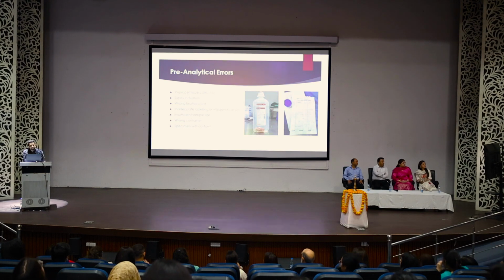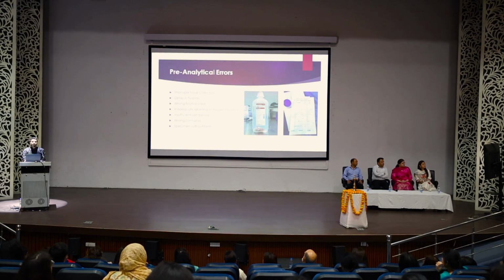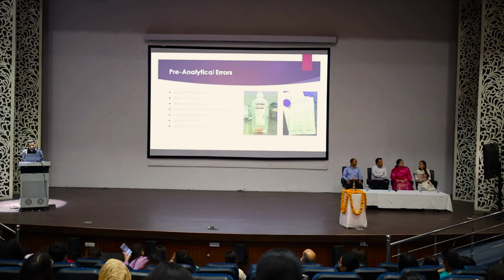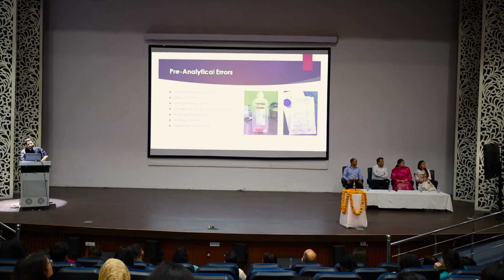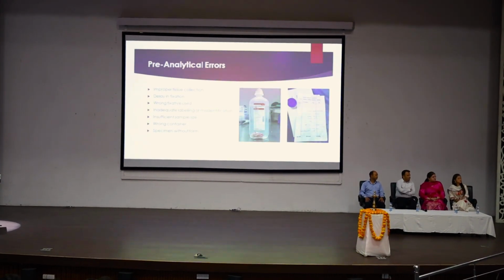By improper tissue collection, we here mean that the person who collects the sample misses the main lesion, or collects from the wrong site, or uses the wrong method for the collection. In that way, the tissue gets damaged if they use wrong ways of collection, and we may lose important morphological details of the tissue. Delaying fixation. By delaying fixation, we understand that sometimes they collect the sample but do not immediately put it into the fixative.